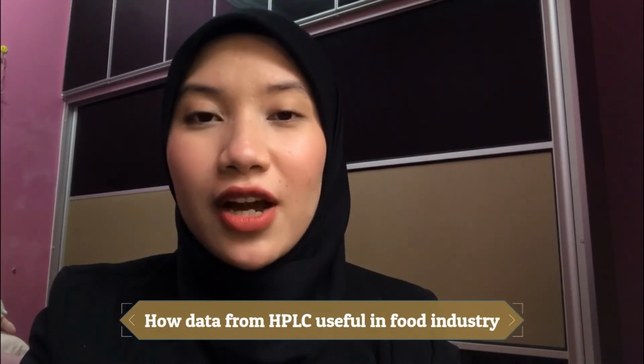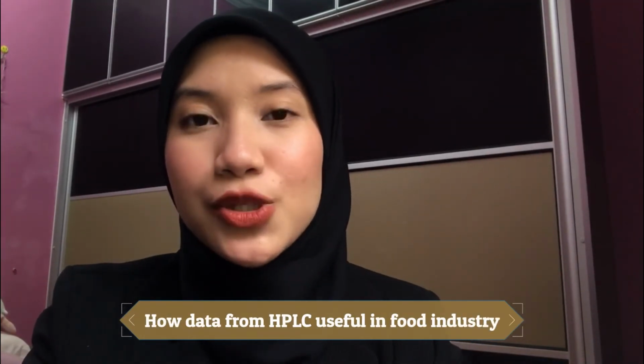Lastly, I will give a brief explanation on how data from the HPLC are useful in the food industry. In HPLC, we have detectors. In food analysis, the limit of detection, or LOD, and limit of quantification, LOQ, are defined as 2 to 3 and 10 to 20 times the noise level.